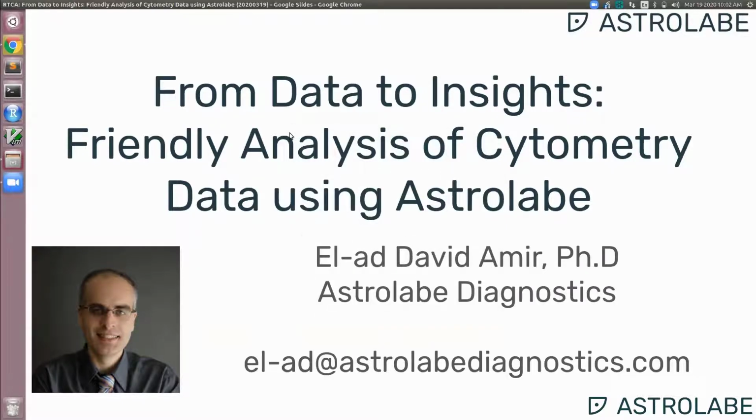So I'm going to tell you about data analysis with Astrolabe, which is an online platform that we developed for the analysis of flow and mass cytometry data. And before I begin with Astrolabe itself, I want to discuss the motivation a bit.